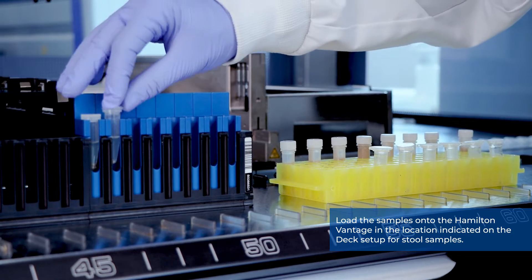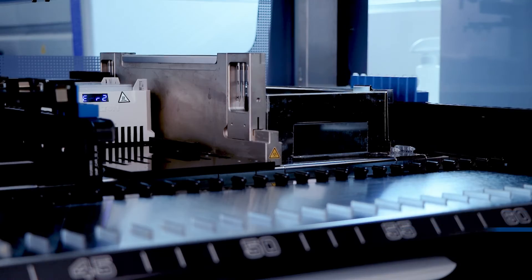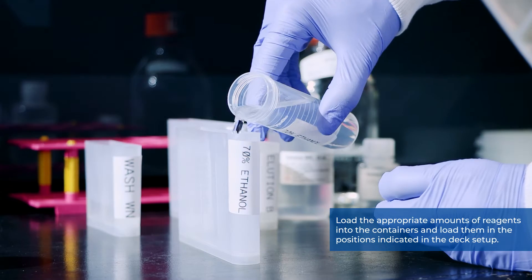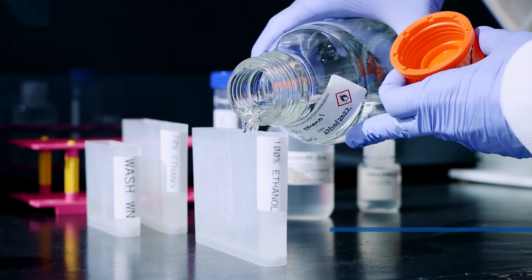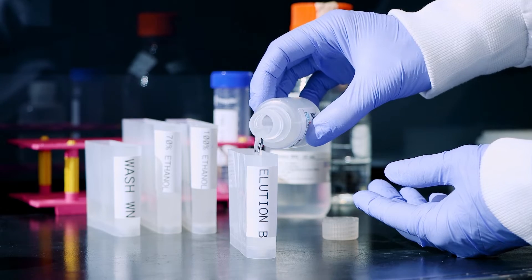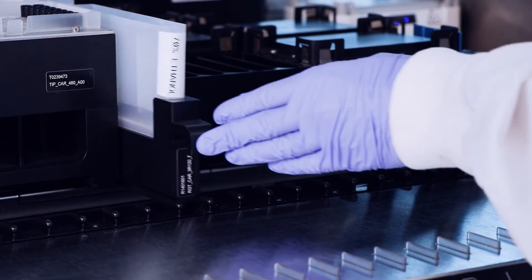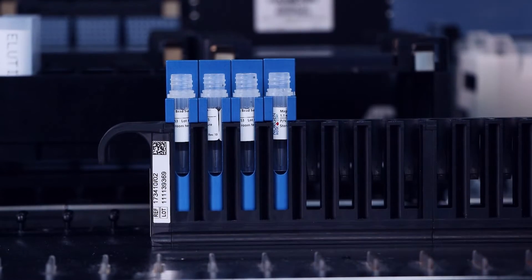Load the samples onto the Hamilton Vantage in the location indicated on the deck setup for stool samples. Load the appropriate amounts of reagents into the containers and place them in the positions indicated in the deck setup. Once your setup is complete, it is time to run the extraction method.